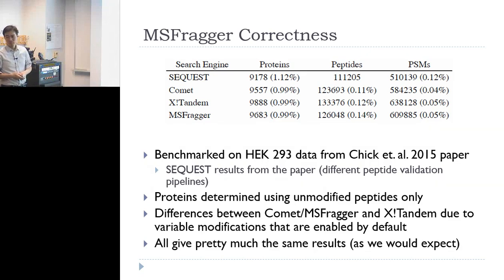That's excellent. I'd be curious, in a typical post-translational modification search of, say, phosphorylation, you would look for peptides that have that mass modification on certain amino acids. But how many of those unidentified spectra are due to that same modification, but in some kind of weird fragmentation that is some different mass from that? I think that this type of thing would allow you to investigate how many spectra I'm missing that are phosphorylated, but that don't have that canonical minus 80 Dalton mass.